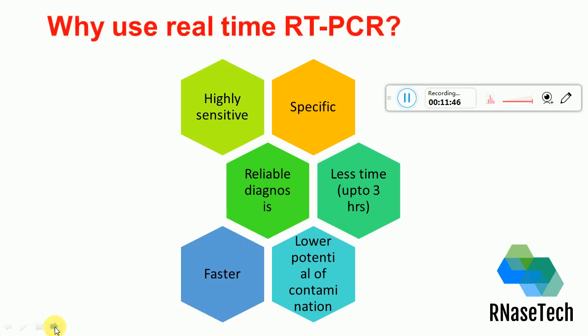So why are we using real-time RT-PCR? Real-time is nothing. In real-time RT-PCR, we are seeing the result as soon as things are happening. That's it. Nothing more than that. So what are the benefits of using the RT-PCR technique for diagnosis of coronavirus?